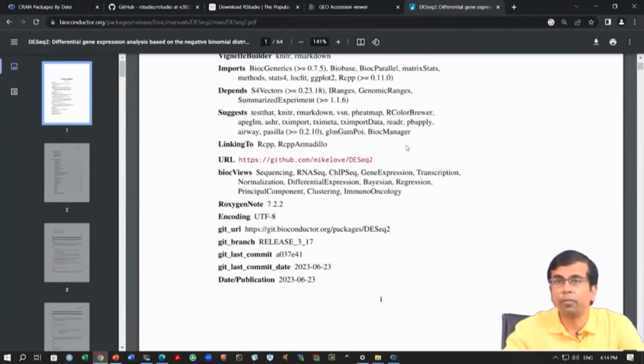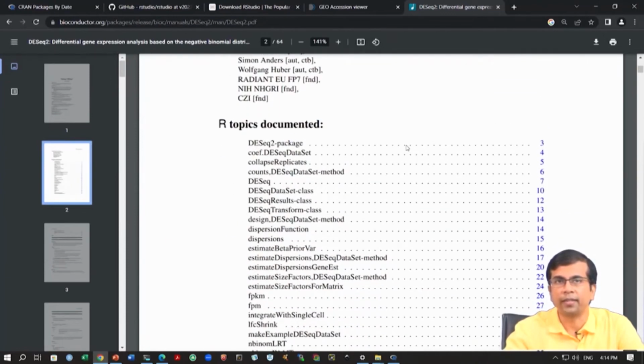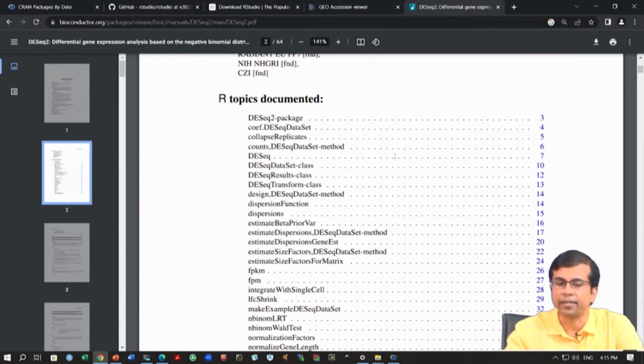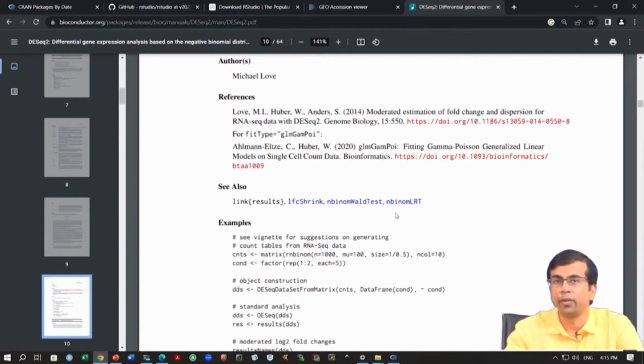Before you actually go about doing this differential expression analysis, you have to create something called a DESeq data set. The DESeq data set combines the count data along with the sample information. This information is important for all these comparisons, because it contains the technical replicate information, the condition information, the design of the experiments. That combination we have to create. That part we have to do through this DESeq data set class. This is where we have to create this data set from our count data that we have loaded as well as the sample information.